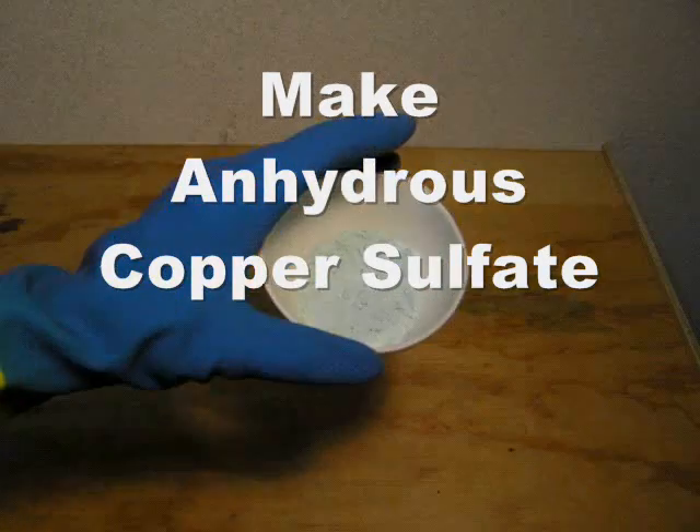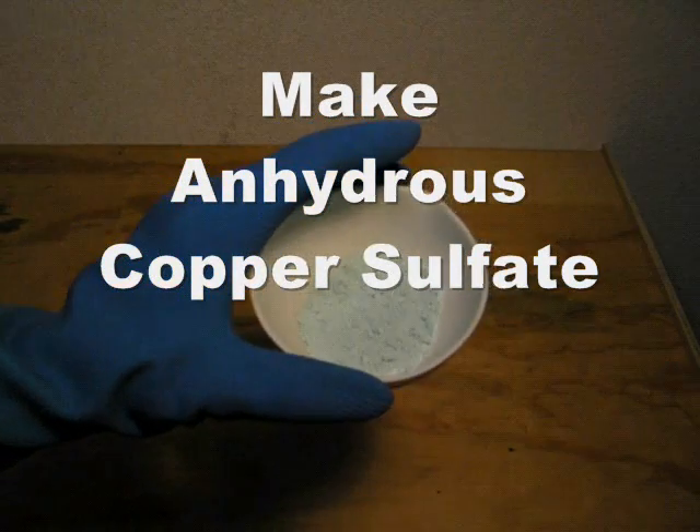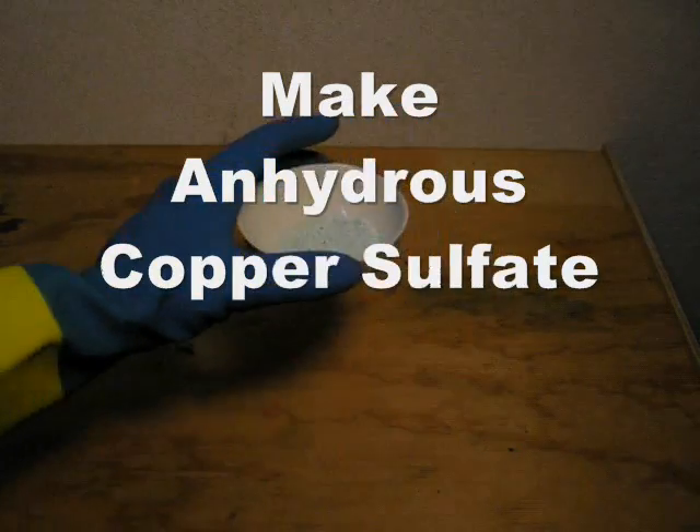Welcome to Paradox Home Chemistry. In this video, I'll show you how to make anhydrous copper sulfate by heating copper sulfate pentahydrate.